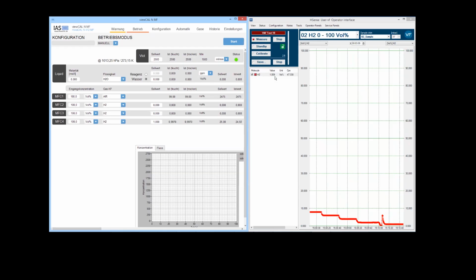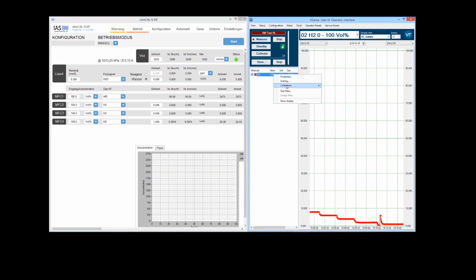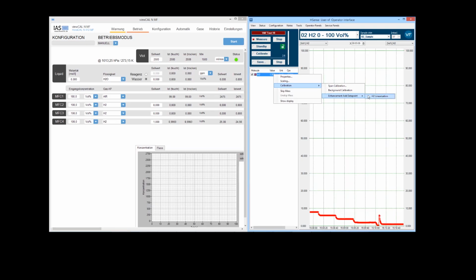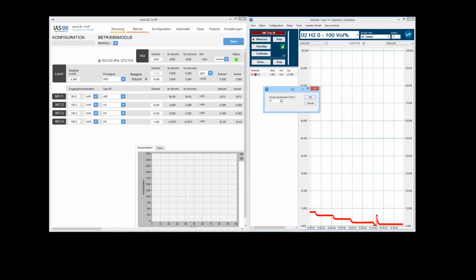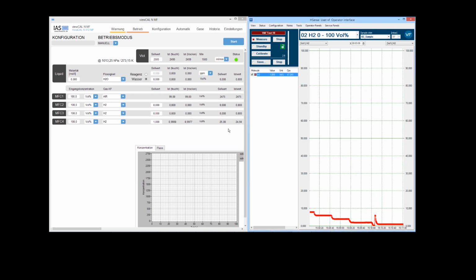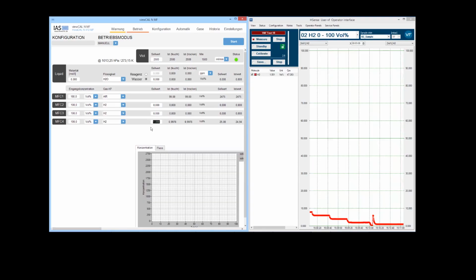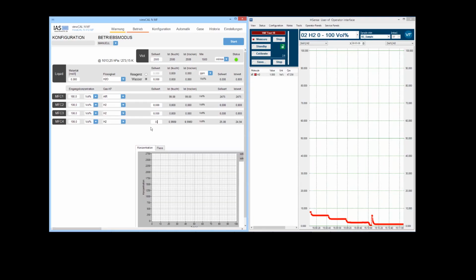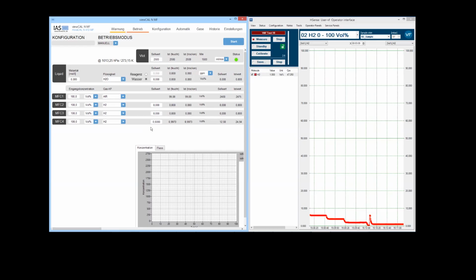Again, we're going to wait for saturation of the signal. Go through the same process. And the last point that we typically use in our factory linearizations is 0.5 volume percent for this method.